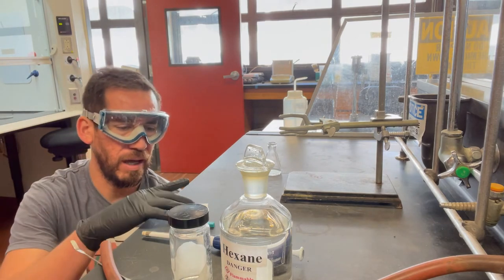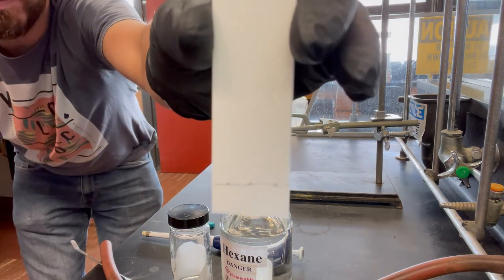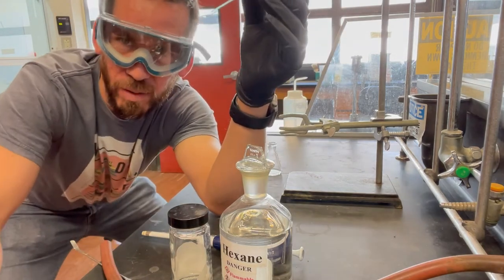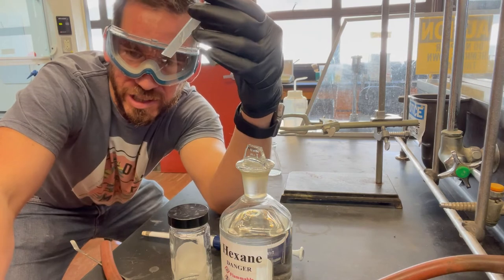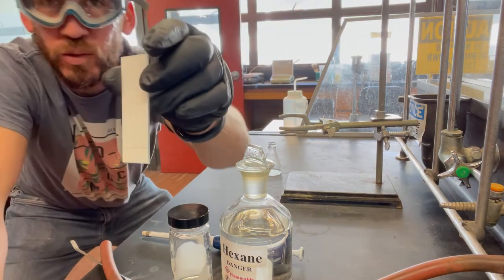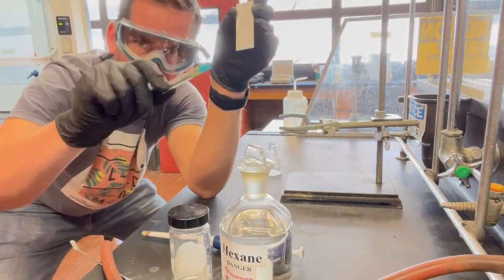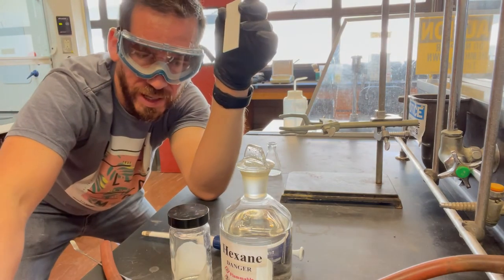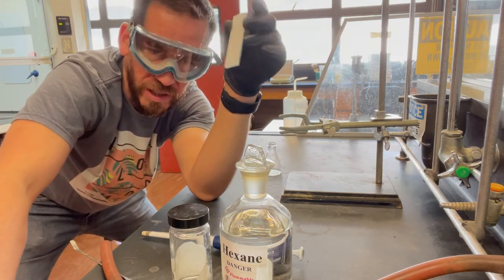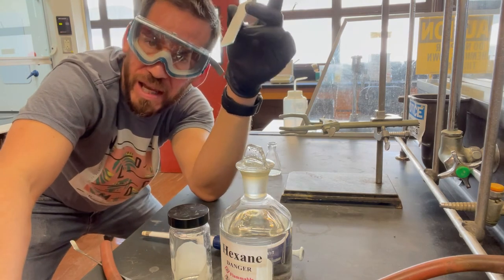I already made, I gotta fix it, but I made a TLC plate, right? So I didn't have a pencil, because like, who has pencils, right? We're all about that pen game and digital pencils. So I had one of these though, and I used that as my pencil, so that's cool. It works. But you can see that I marked the line, where we spot it, as well as three spots. I'll just change it to a fourth one. Add a fourth one in there. We want to get some good spacing though, so that they don't morph together.